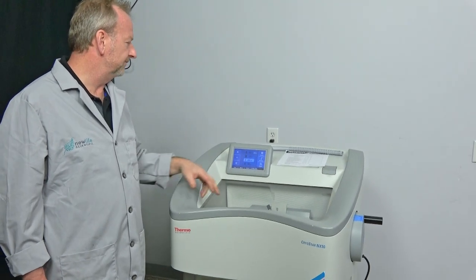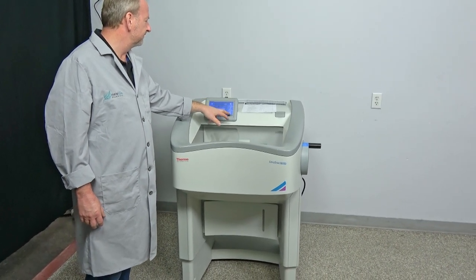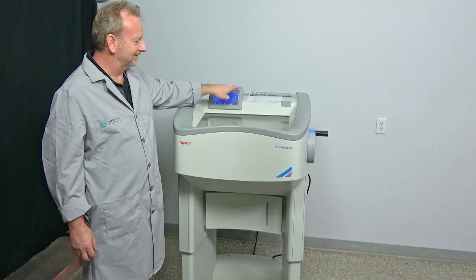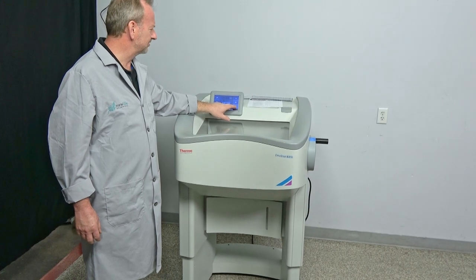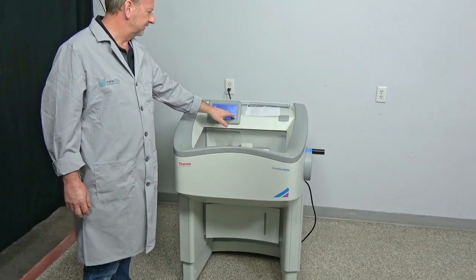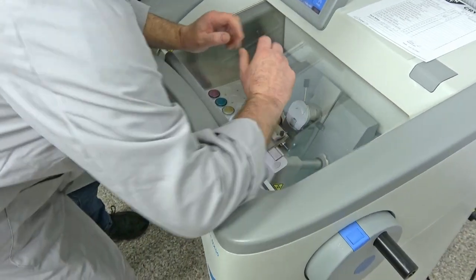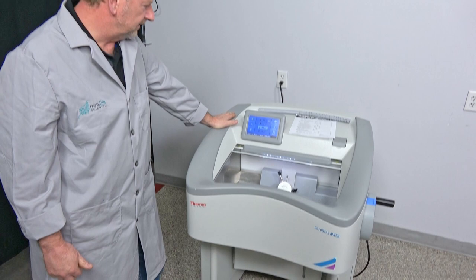First thing I'm going to show you is one of my favorite options — the height adjustment. It's a touchscreen interface, so it works really nice. The arrow pops up here and you just push and hold it. For all you really tall people who don't want to bend over, this is the machine for you. Or if you want to sit down, just drive it all the way down, pull up a stool — look at that, really nice. And then of course they have the body hugger here and a nice contour for your arms to reach right in.